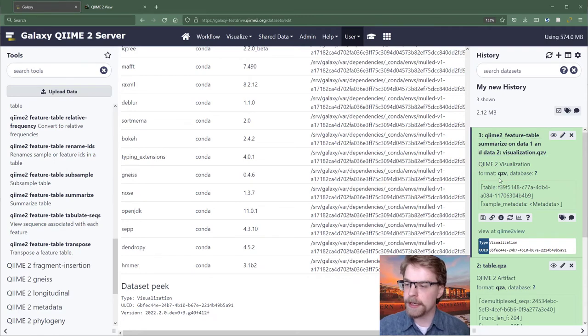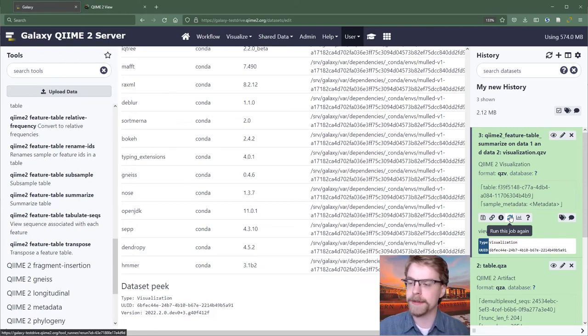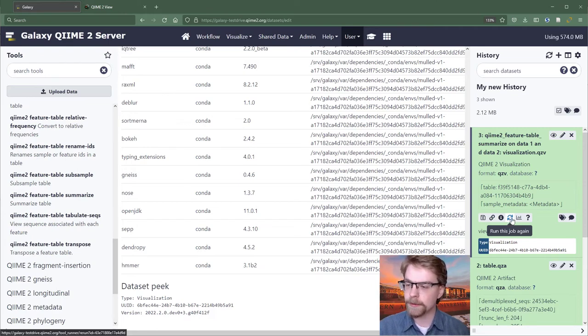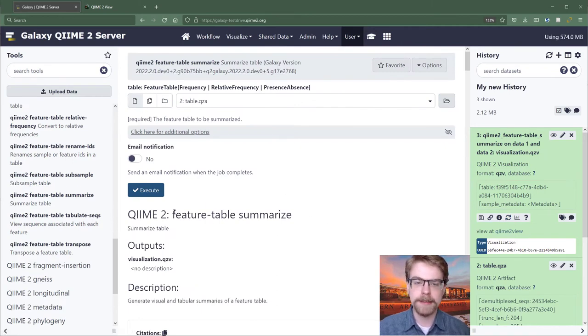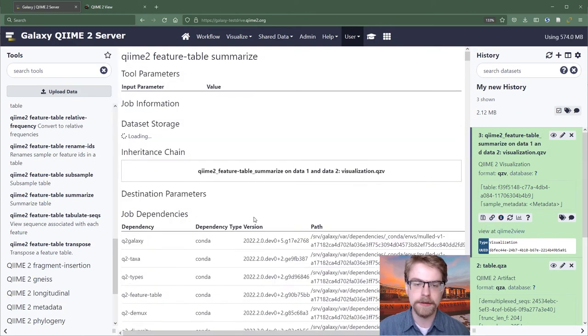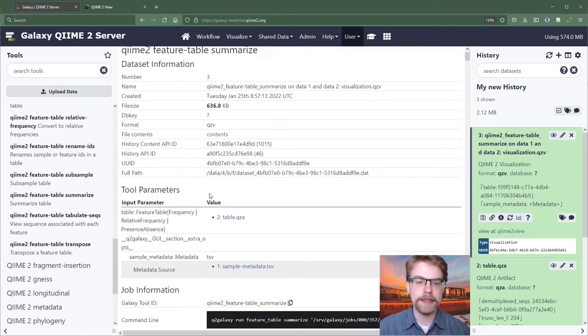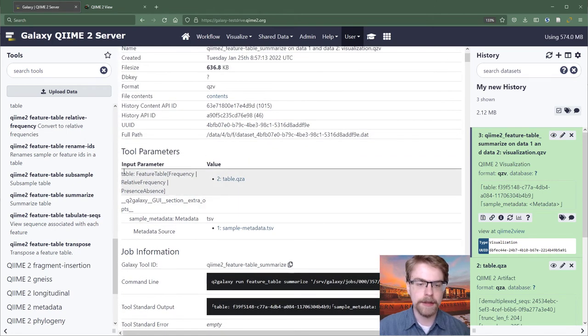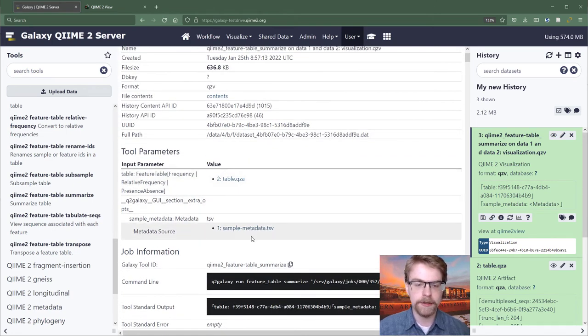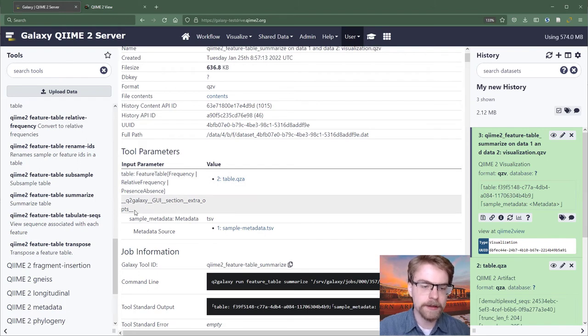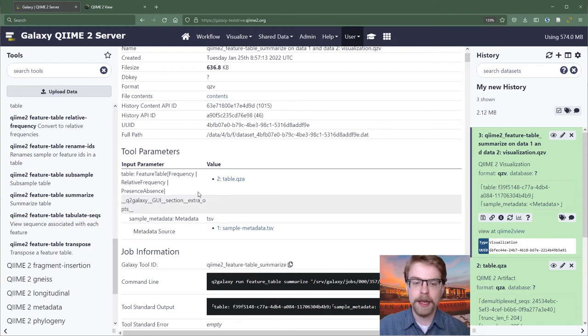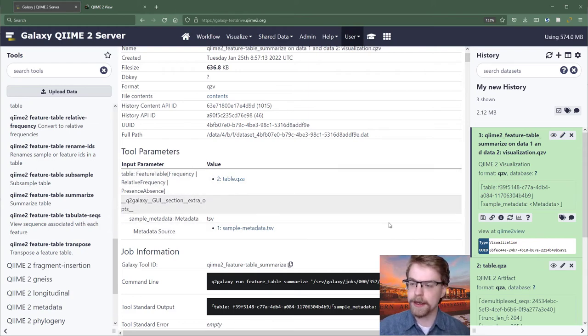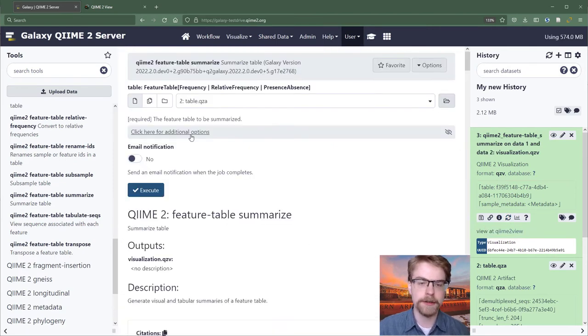So in addition to that, we have the ability to run a job again. And this is super convenient. So if we press this little refresh looking button, what that's going to do is set up basically the same inputs. And Galaxy knows what the inputs were because if we go back to the last page, the view details, we see that Galaxy has all of these different tool parameters set up to specific values. And some of these look a little crazy, but it's meaningful to Q2 galaxy, and that's all that matters. And so because we have all of these parameters already set up, Galaxy is able to run it again with the same parameters.